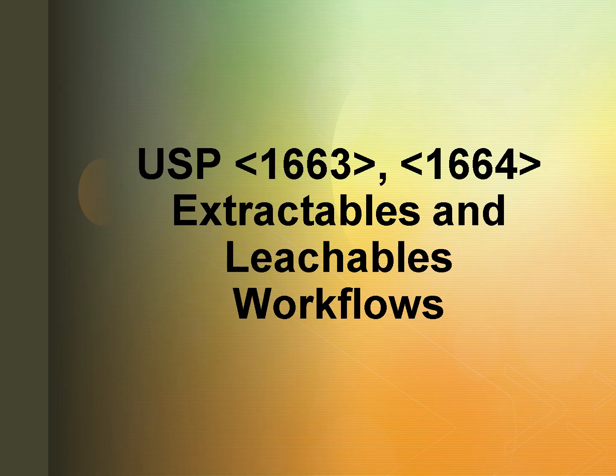In today's session, we'll explore how these guidelines shape extractables and leachables, or E and L, testing, and why following these workflows is absolutely essential for device approval, patient safety, and market success.